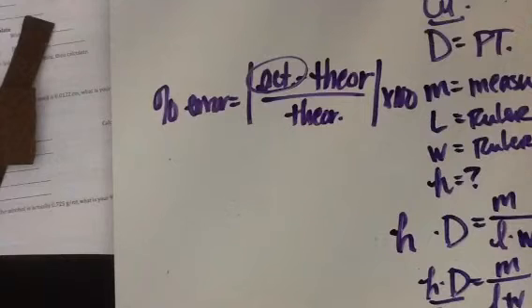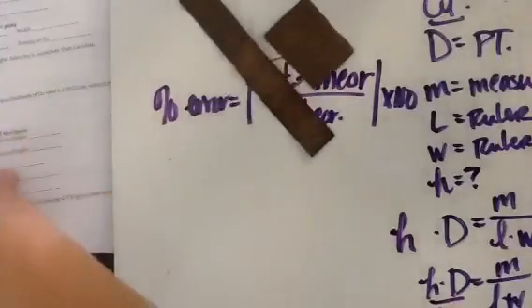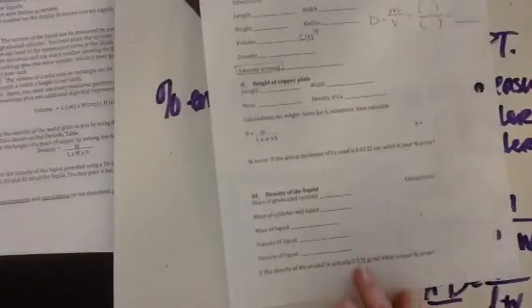So this is one of the few times I'm going to tell you to put the solution back into the bottle when you're done. So there's 1 per team, so take your measurement, put your graduated cylinder onto the electronic balance, always use the same balance, measure out your 20 to 30, record what it is, 24.50, record mass, and then calculate the density of the liquid. And then it gives you, if the density of the alcohol was actually 0.725 grams, what was your percent error?